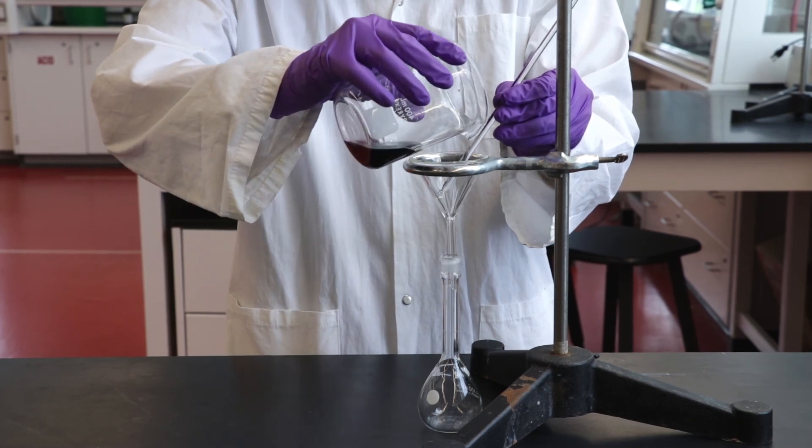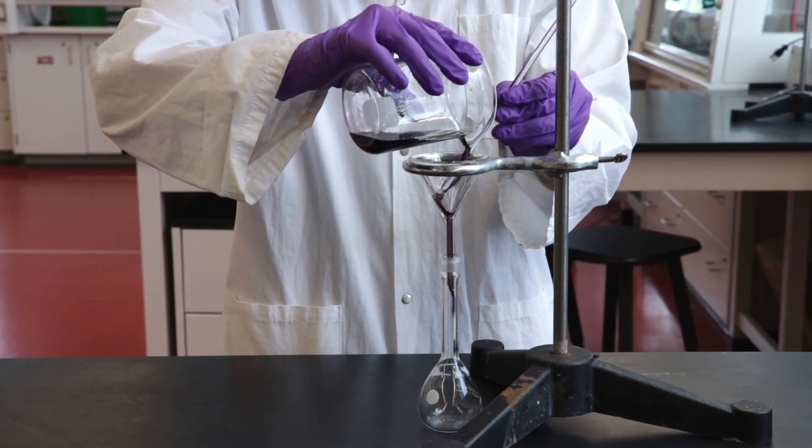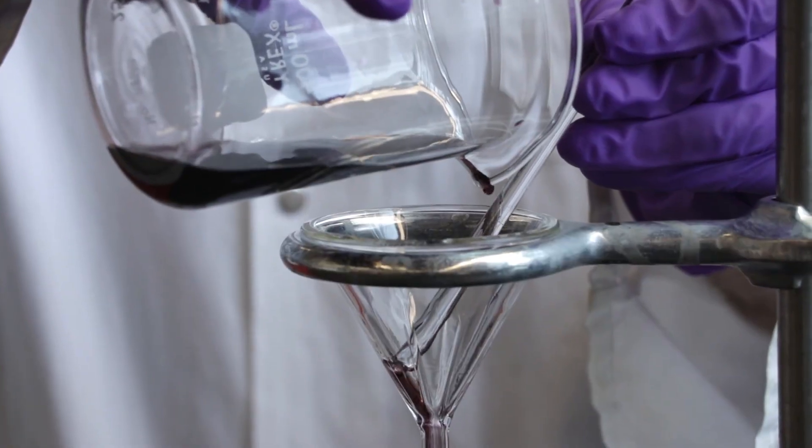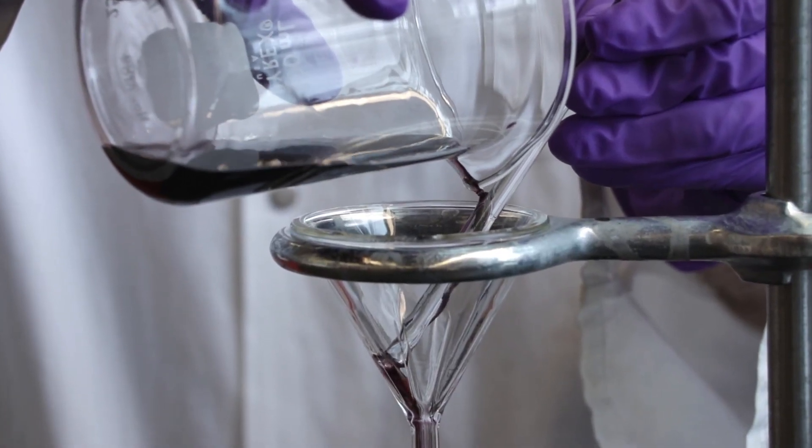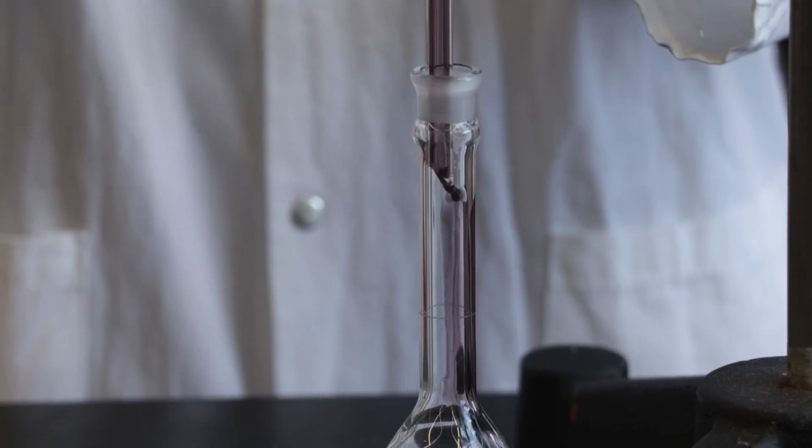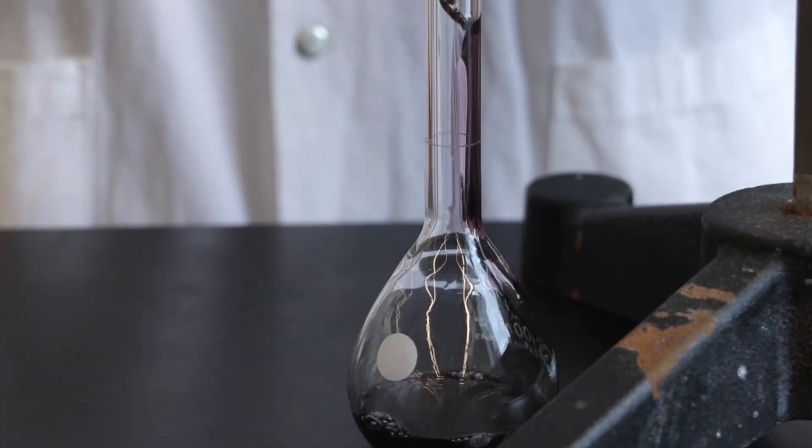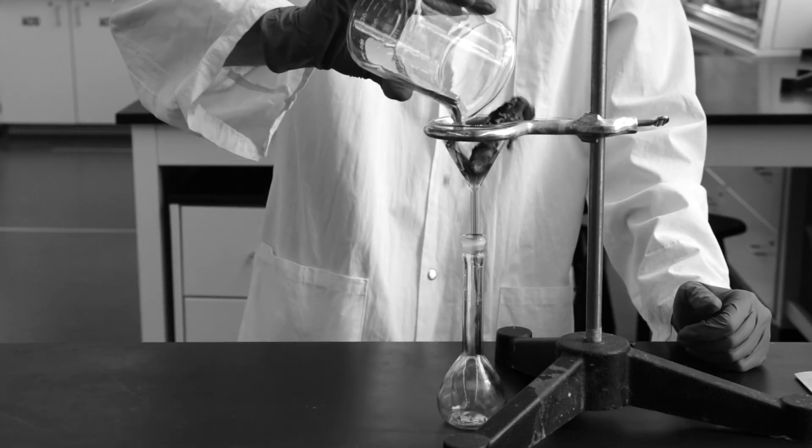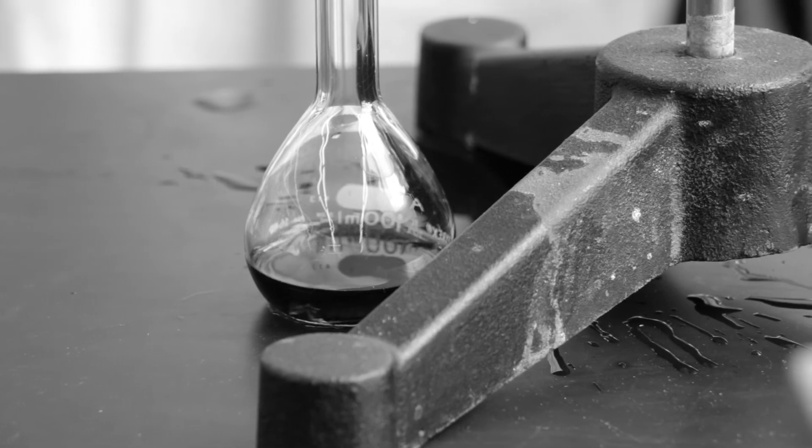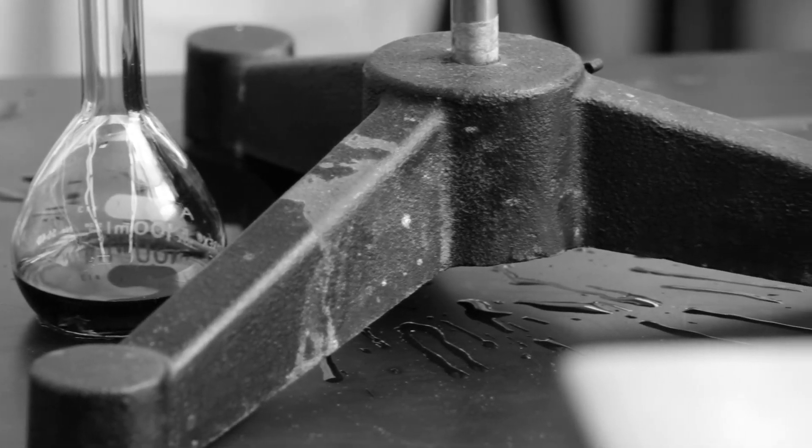Now pour the Kool-Aid solution down a glass rod into the volumetric flask. The purpose of the glass rod is to prevent splashing of the solution outside of the volumetric flask. When a glass rod is not used, splashing is more likely to occur. Notice how some of the solution is lost.